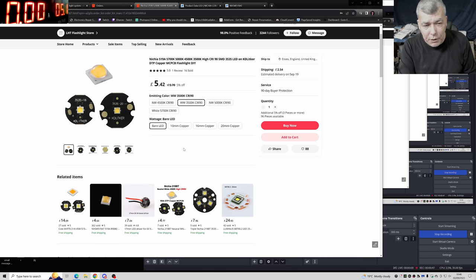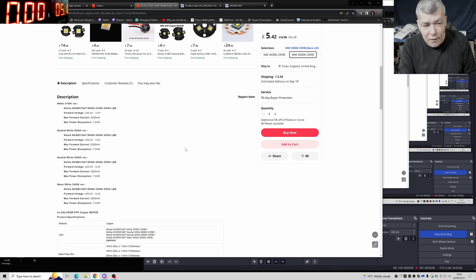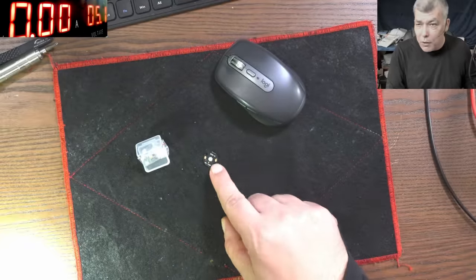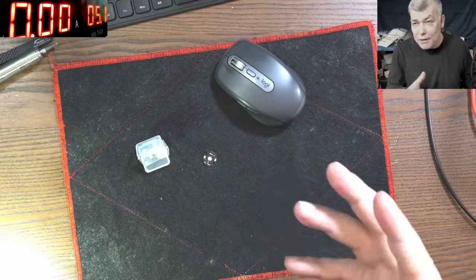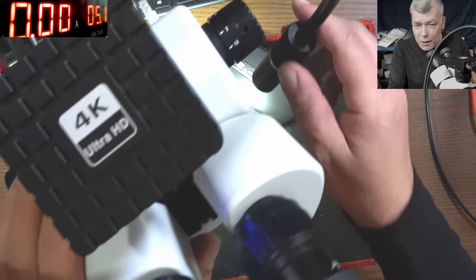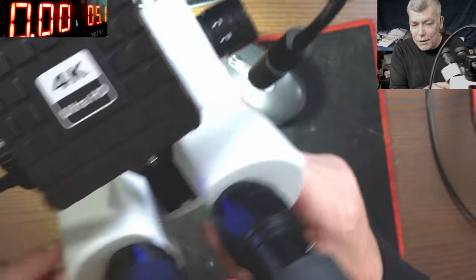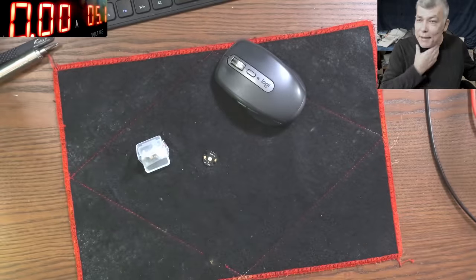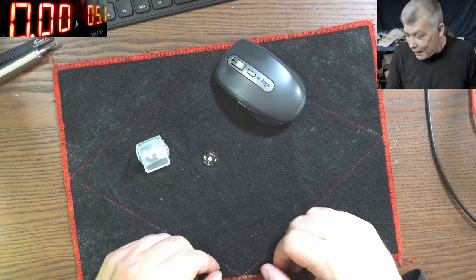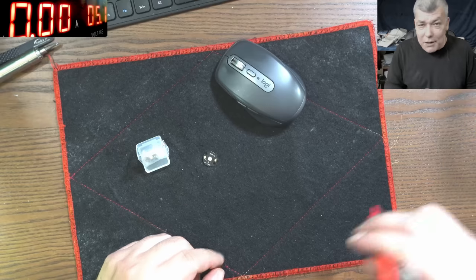I'm pretty impressed with the specification — this can go up to 2.2 amps. Both of these should be equivalent, actually one of these should give us more light compared with both the originals. I have two: one on one side and one on the other side. Now there is a downside — the heat and the current.